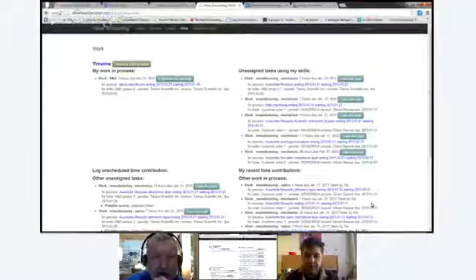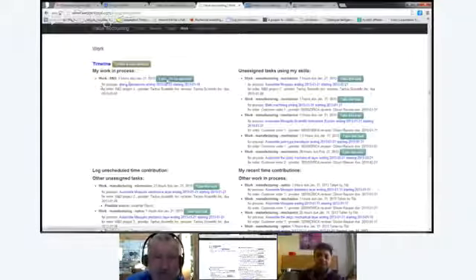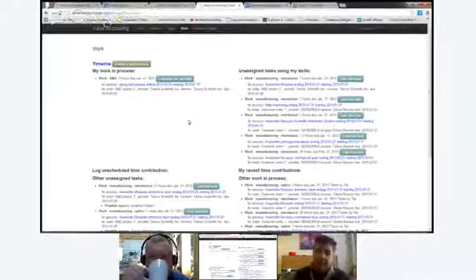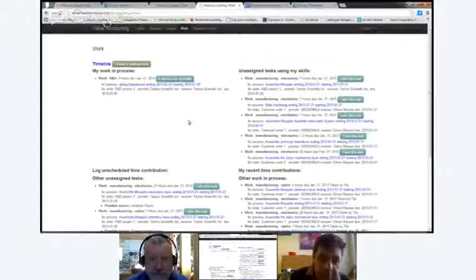Okay. So now you got lab notes for this task. Wait a second, let me just explain what just happened here. The section in the top left corner was empty before. So now when Francois took it, we see what we see.